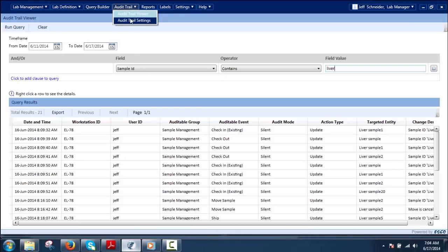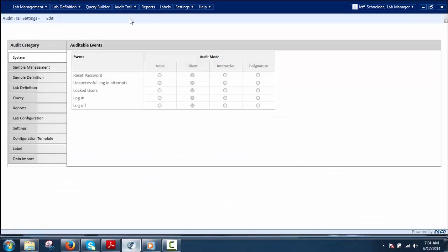Audit Trail Settings allows the user to enforce the audit trail in the Sample Tracker if required. Once enforced, the user can set the events for audit trail logging through the Audit Trail Settings options. There are three types of audit trails: Silent, Interactive, and E-Signature.